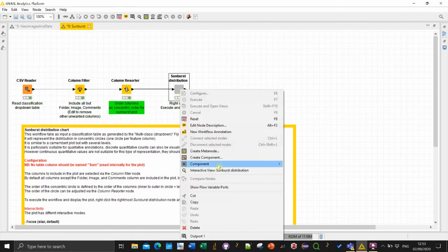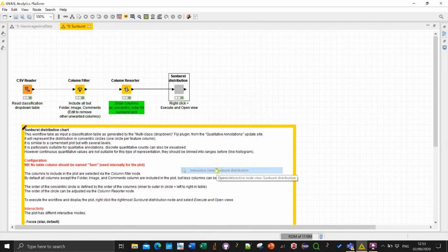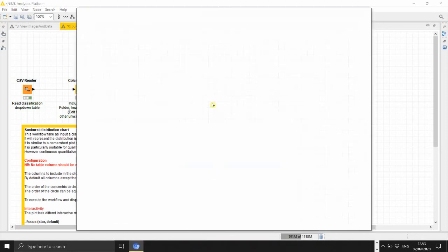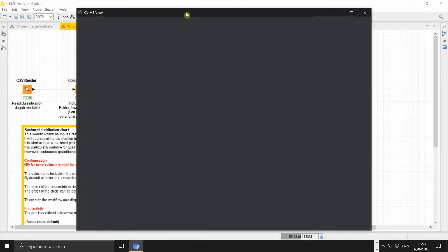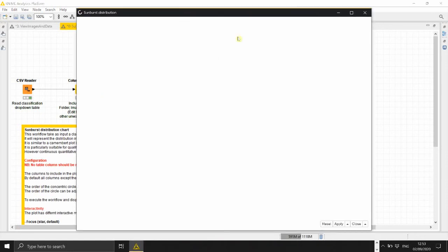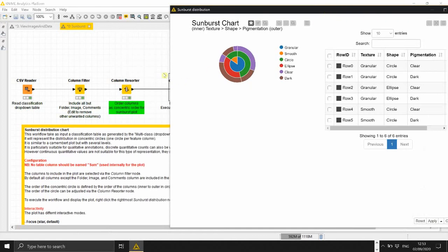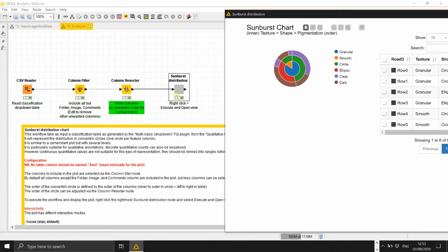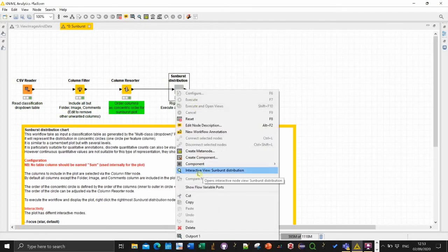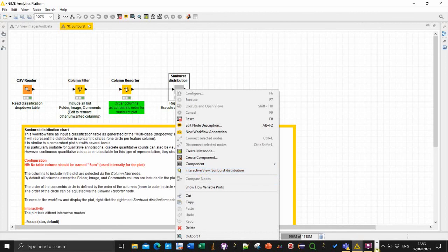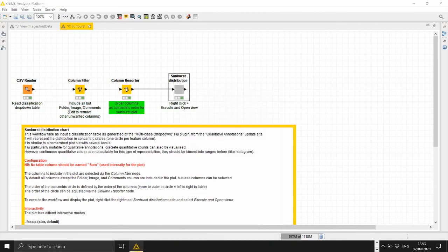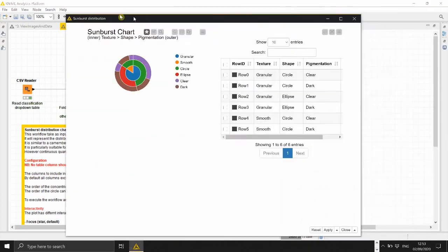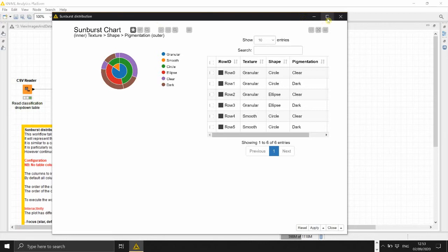So maybe let me show you quickly how the view looks like. So again just execute it and at the very end there is a right click either execute and open views or if you already run it interactive view which opens a new visualization window JavaScript.